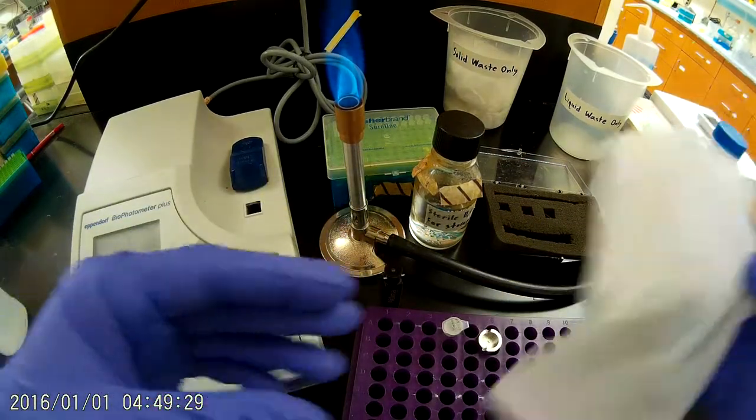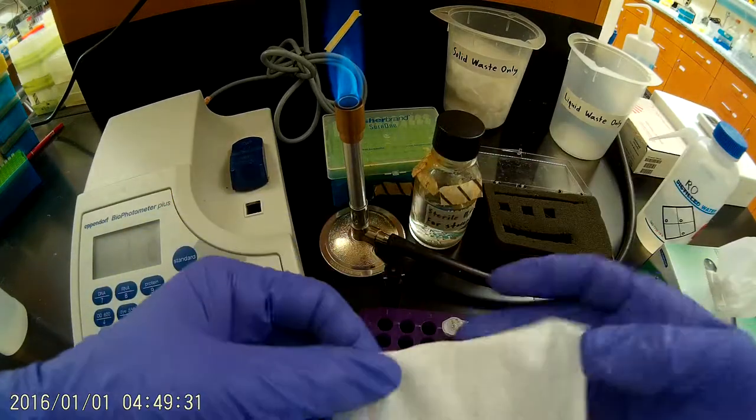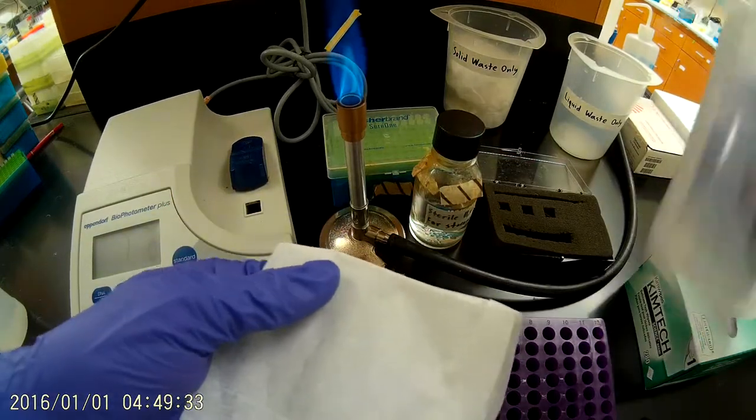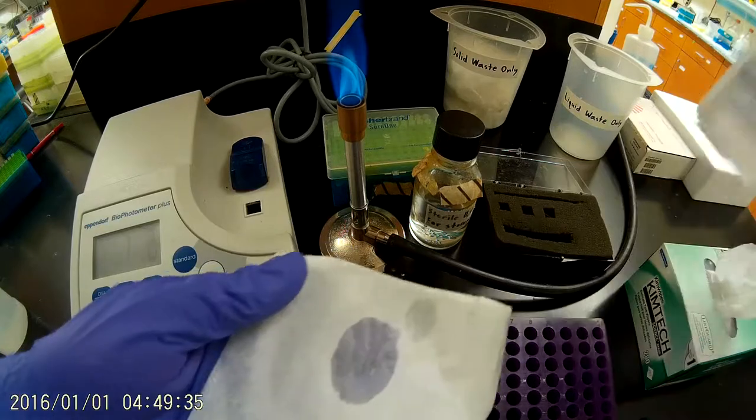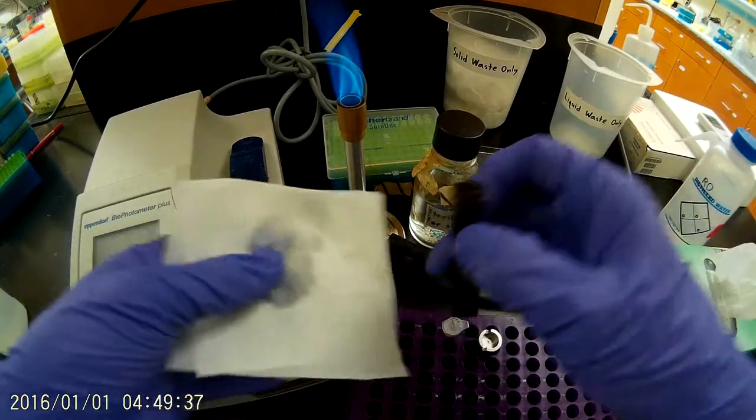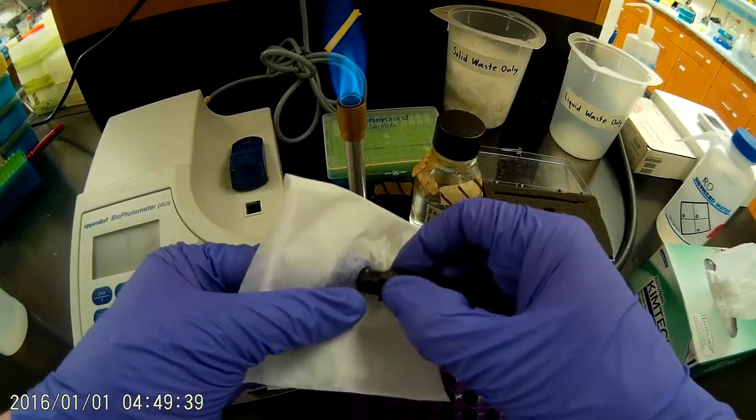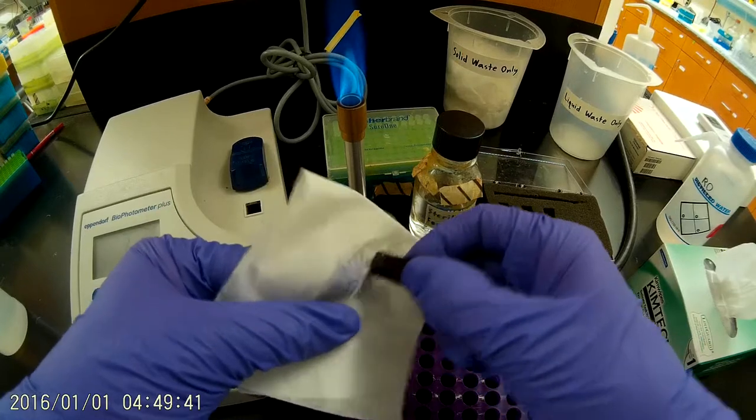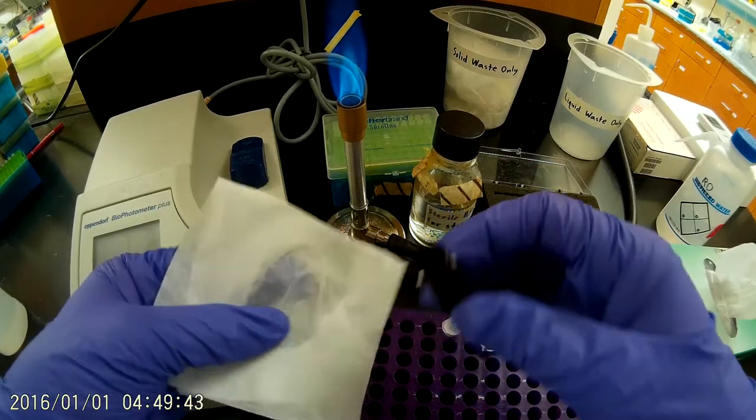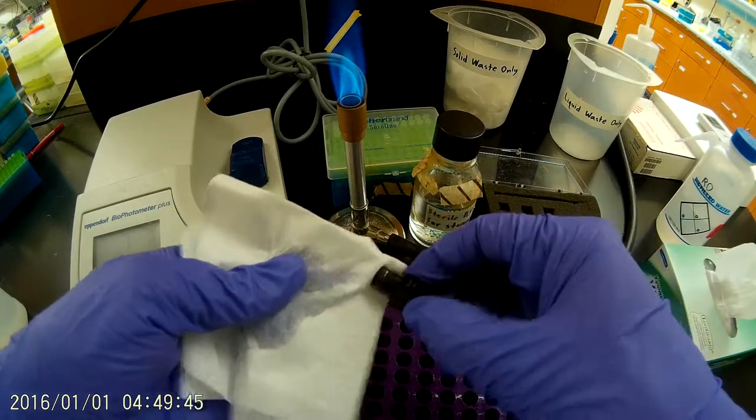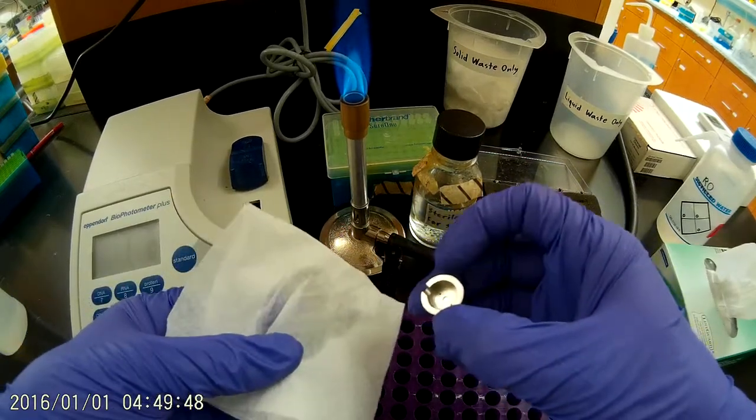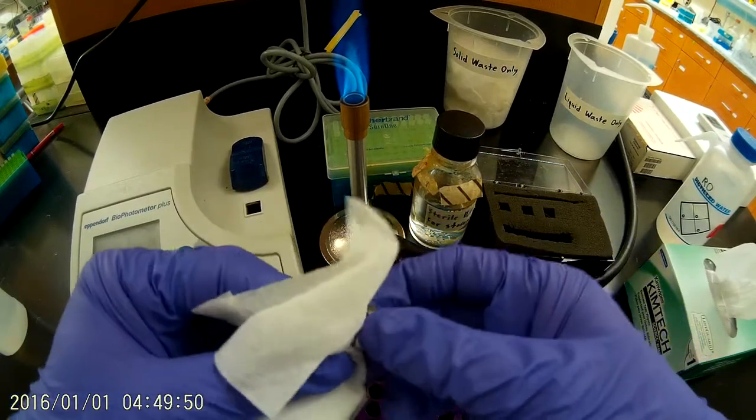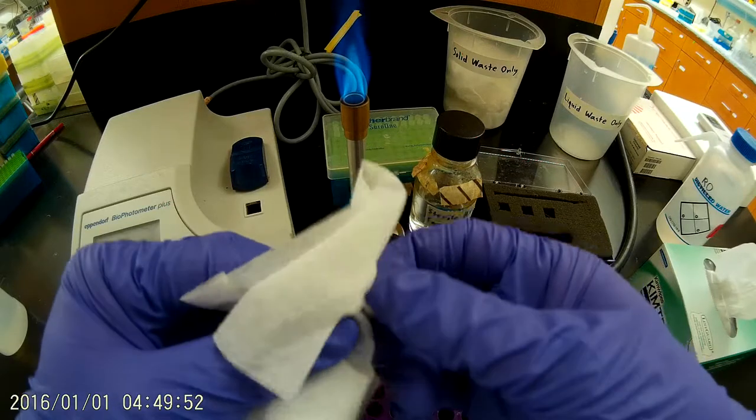We're going to clean that with a kim wipe dampened with RO water. We'll gently clean the glass surface. So that tray there, that's where DNA is going to go. Dry that off. And this is a mirror that will reflect the light back down through the device. You want to clean that off as well.